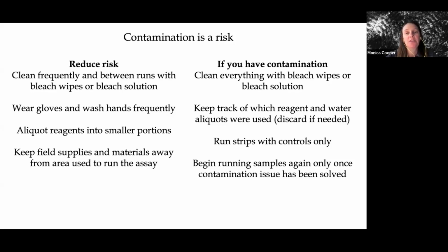If you do get contamination, you need to clean thoroughly and then do some testing with controls only, so that you can figure out where that contamination is coming from. Did you accidentally contaminate the water or one of the reagents, or is that contamination coming from somewhere else?